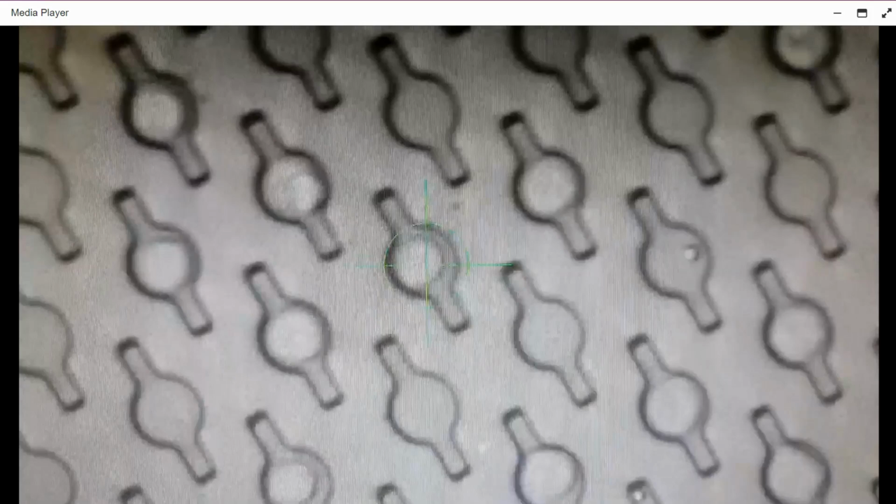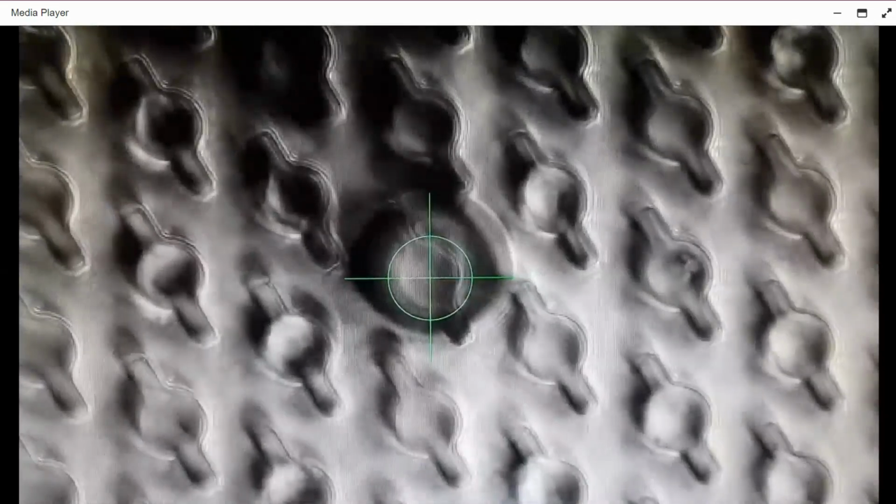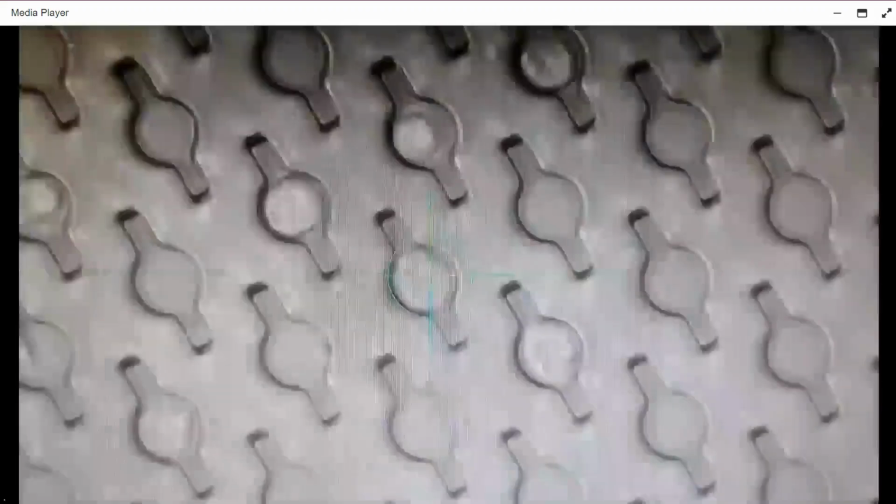You will also notice in this video that some of the frames will be flickering. This is the time when we are actually acquiring images. So you will notice that we acquire images at the beginning of the picking procedure and then at the very end.